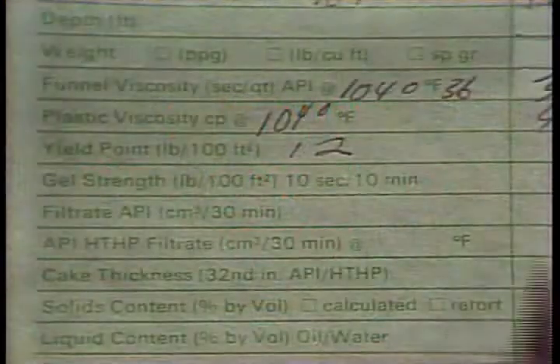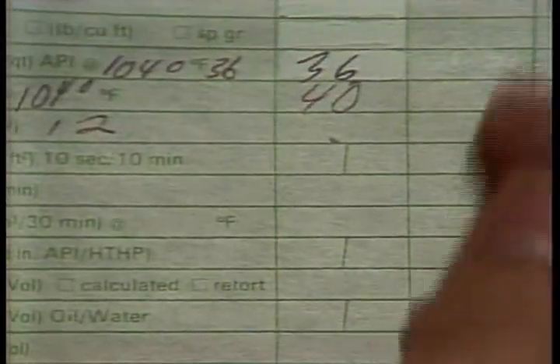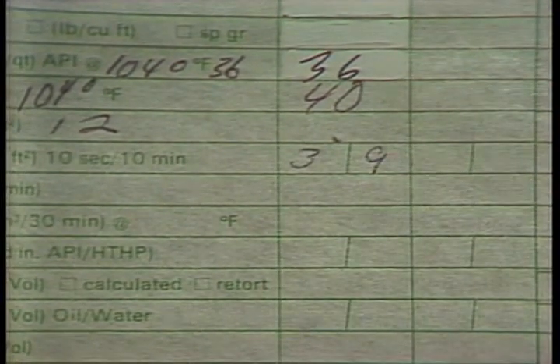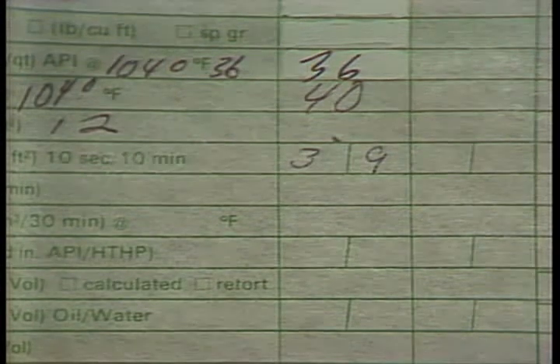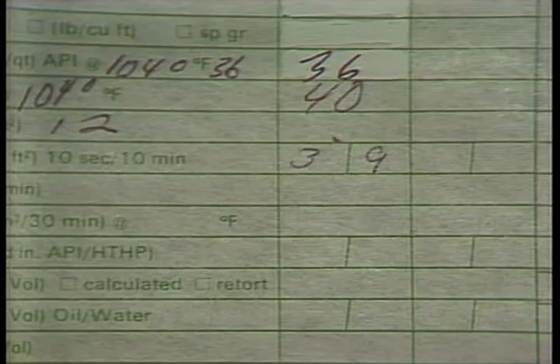These figures are logged into the form. They tell the mud engineer how quickly and to what degree the mud is gelling. They'll help him determine whether or not the mud qualities are consistent with what the conditions require. It'll also let him know if he has contamination problems.